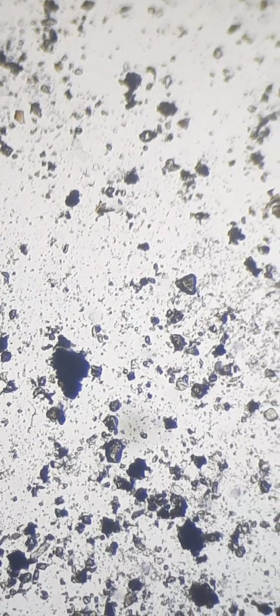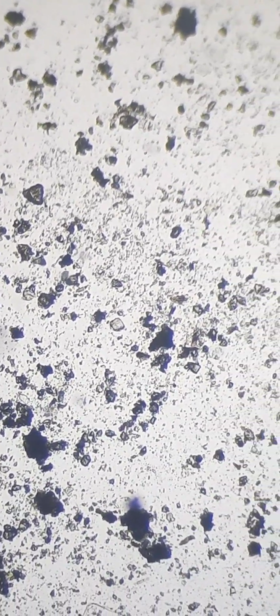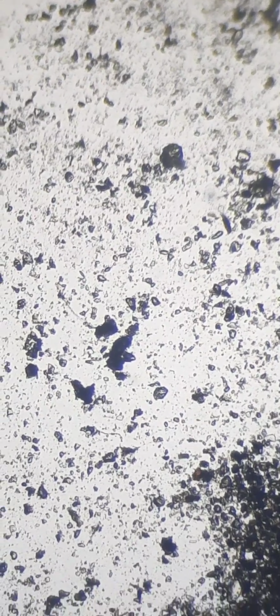Once the slide is accurately quantified, we clear it and begin a new slide, using the same method as before, taking from the dotted line of the Eppendorf tube. This is done until the supernatant completely runs out.